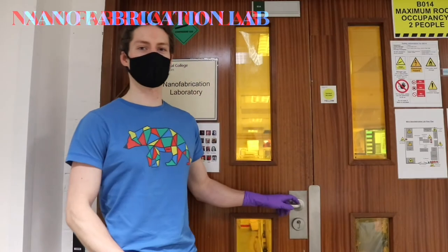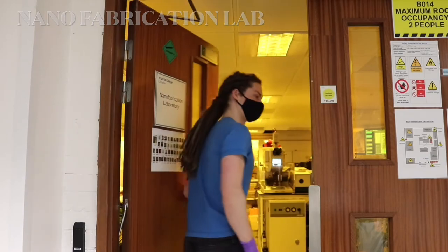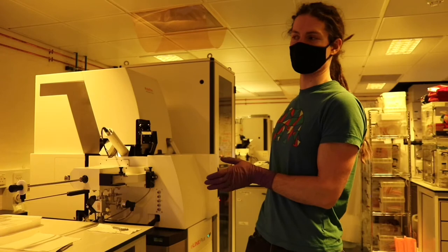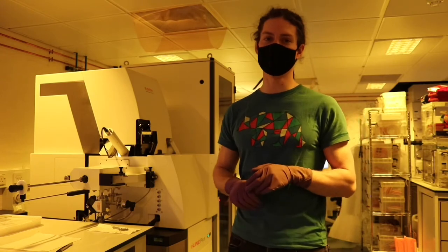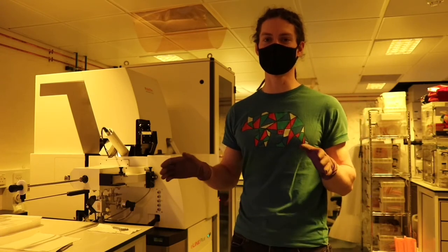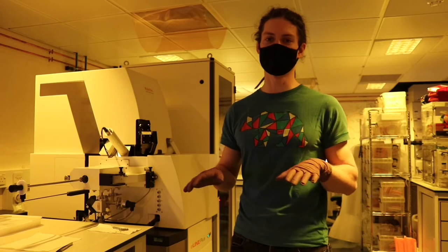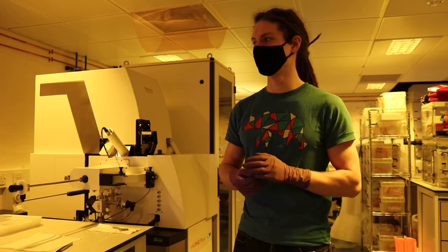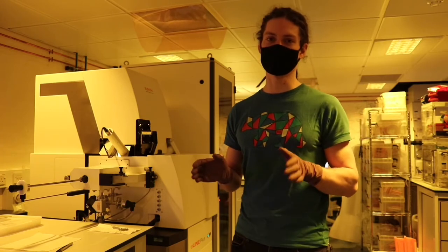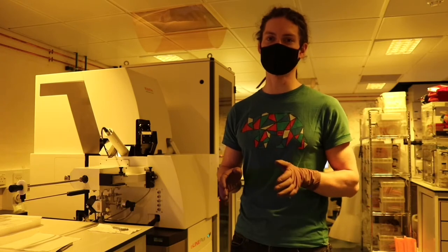Welcome to the Nanofabrication Lab. These are our two electron beam lithography systems. We use these to pattern into electron beam resist to make stencils to deposit materials into to make our samples. They have resolutions of down to around 20 nanometers with 10 nanometer gap sizes.